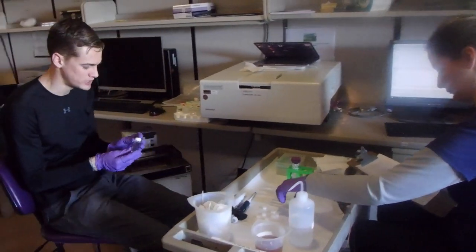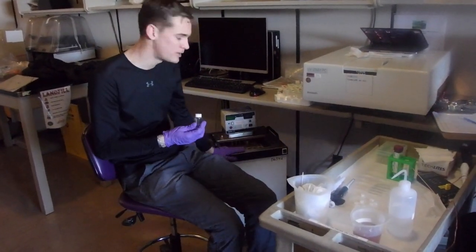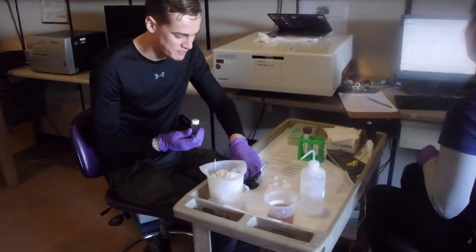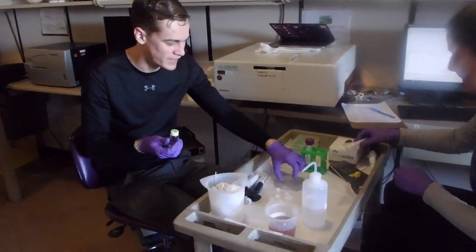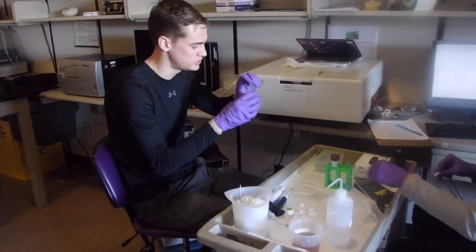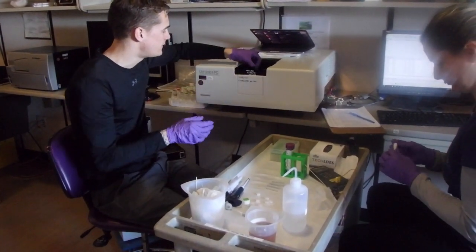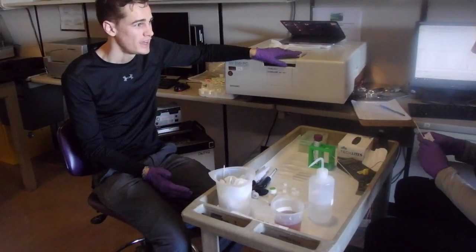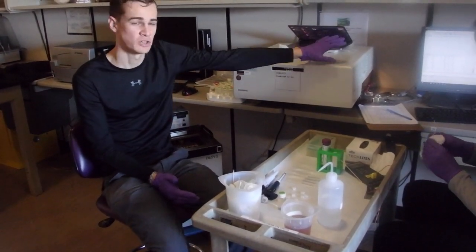So the first thing we do is take the samples that we have of our uncontaminated seawater from downstairs and warm them up in a bath to the same temperature, 25 degrees Celsius. And then we take a pipette, which gives us an exact volume of this sample, and we put it into a cuvette, which is this fancy vial. And then we put it into this machine, which is called a spectrophotometer. Light goes through the water sample and measures absorbance at different wavelengths of light, which shows up on that computer.